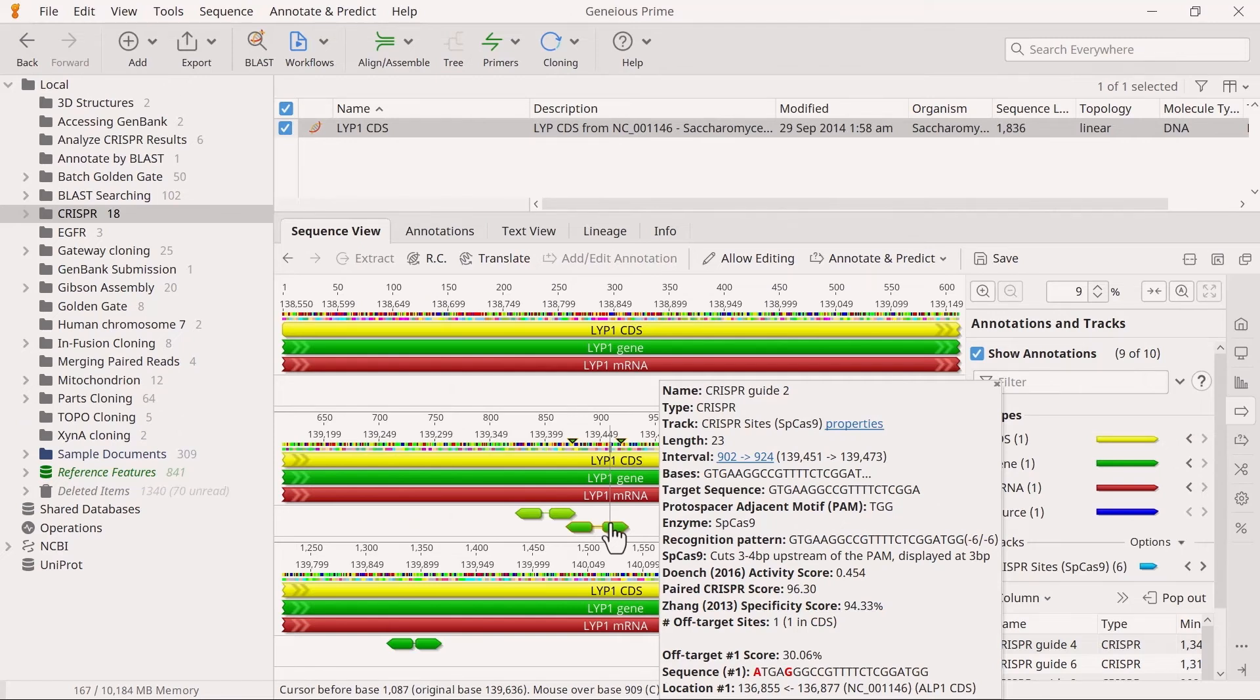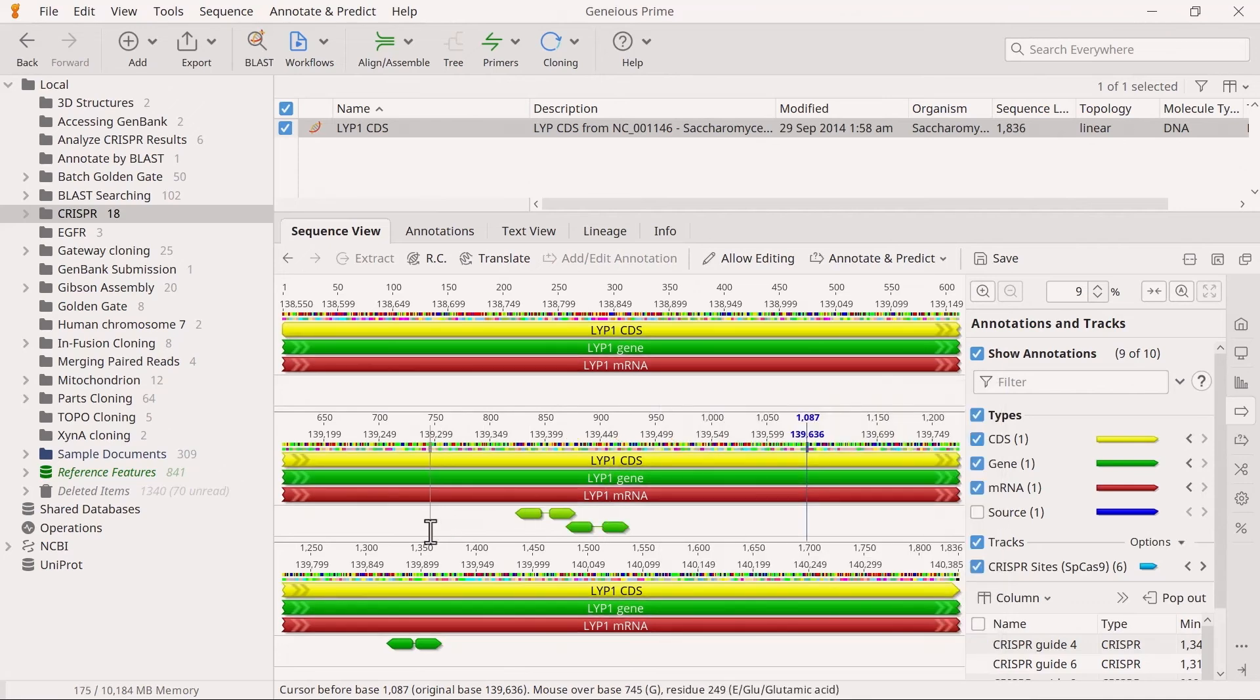Each CRISPR site is linked to its highest scoring paired site, unless that second site has an even higher scored pairing with another site. The site pairs are colored according to their paired score, instead of their individual CRISPR scores.